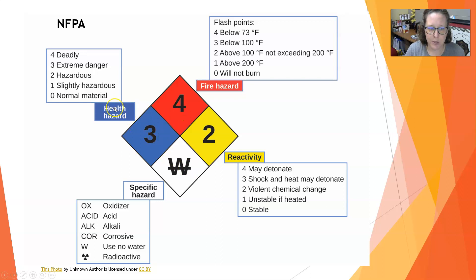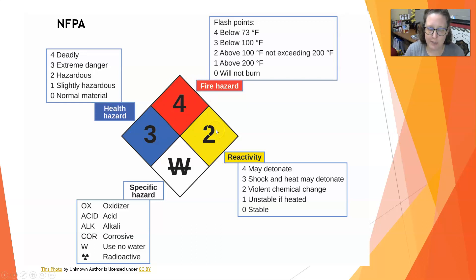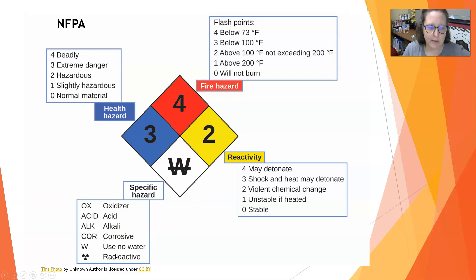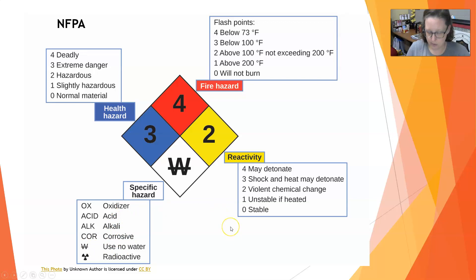On the NFPA diamond, the higher the number the more hazardous — four is the highest. The white section is for specific hazards and usually has a symbol, such as radioactive, 'no water,' corrosive acid or alkali, or oxidizer.